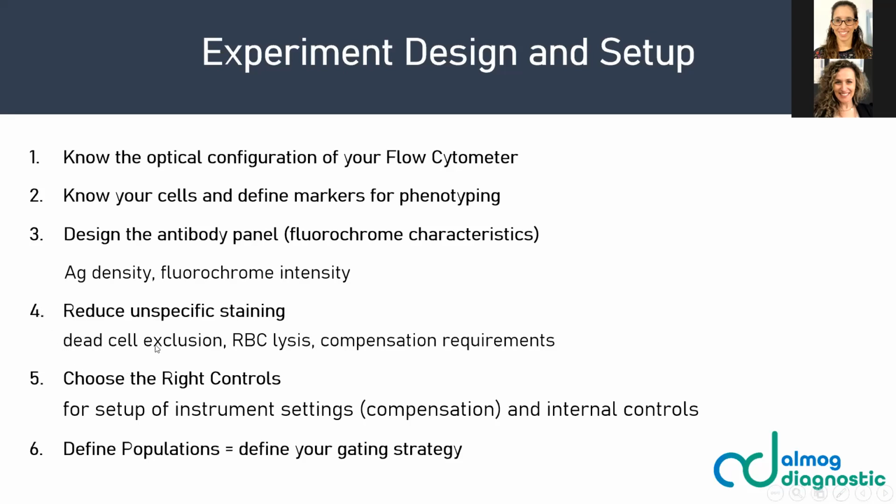If it's the gate out of dead cells from your experiments, if it's the red blood cell lysis that needs to be done, and of course the compensation requirements, correct compensation is very important also in order to get accurate data. Controls that are needed for the setup of the instrument, meaning compensation and the voltage setup, the internal controls, the negative controls, we will also talk about them.